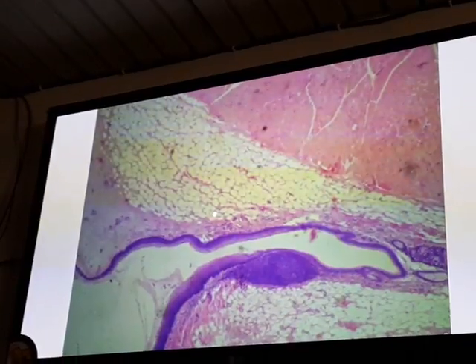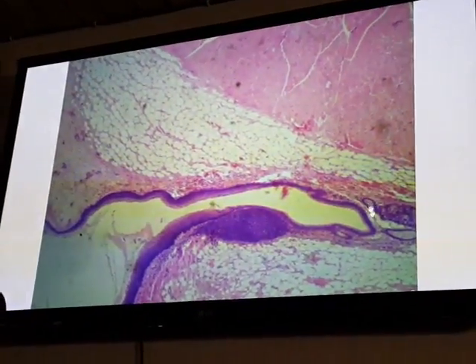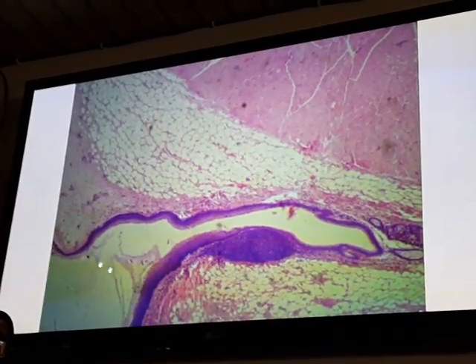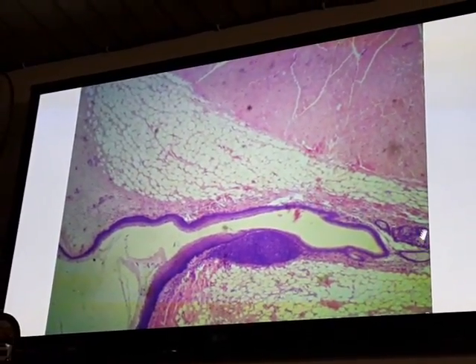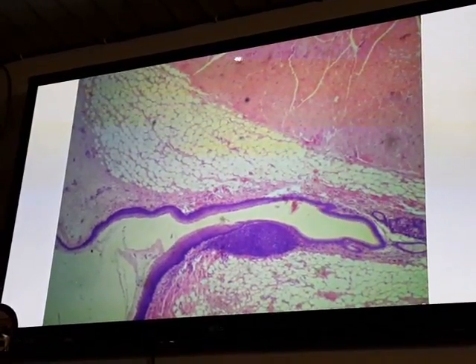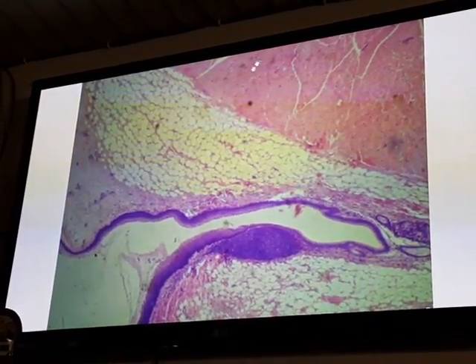Is the larynx clear? We have two pairs of folds. The upper is pseudostratified, while the lower is stratified non-keratinized. Lamina propria with serous glands. Vocal ligament. Beneath, we have the vocalis muscle.